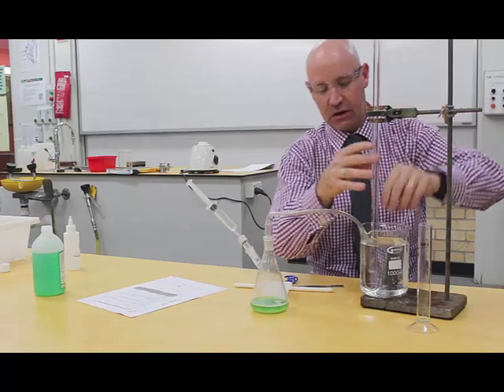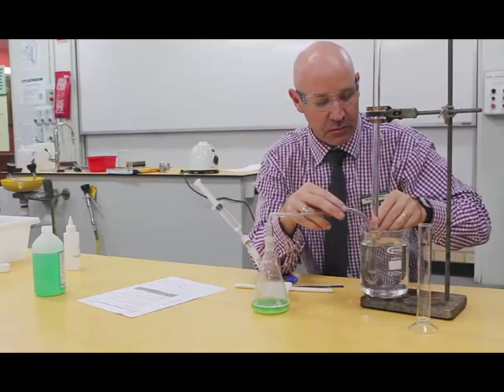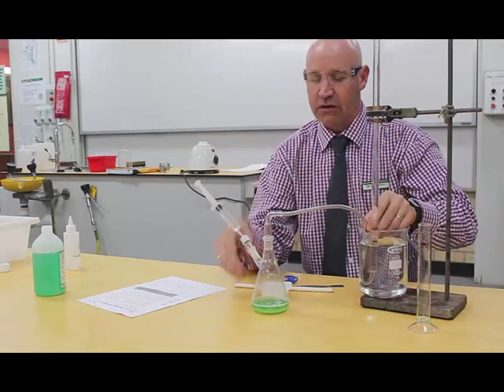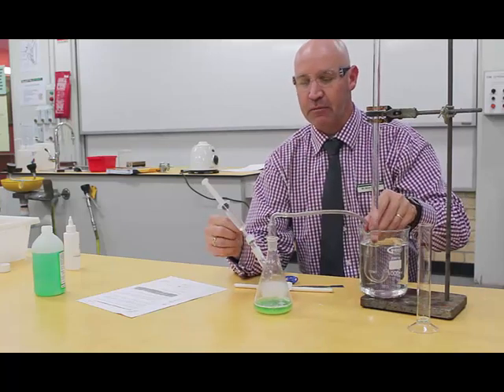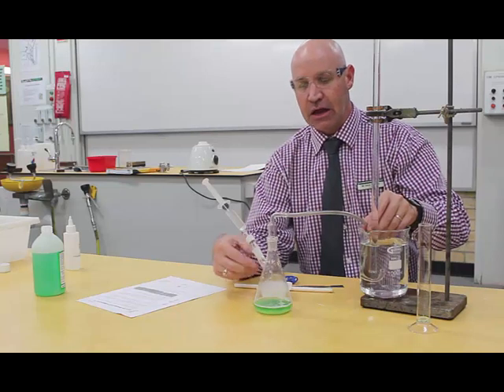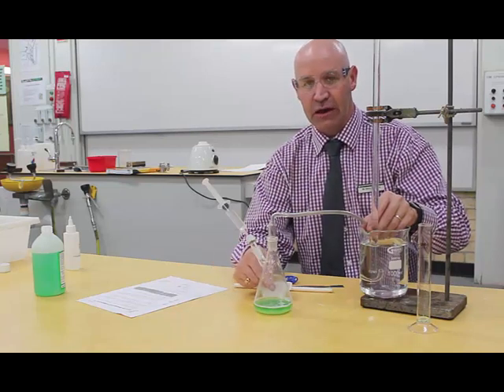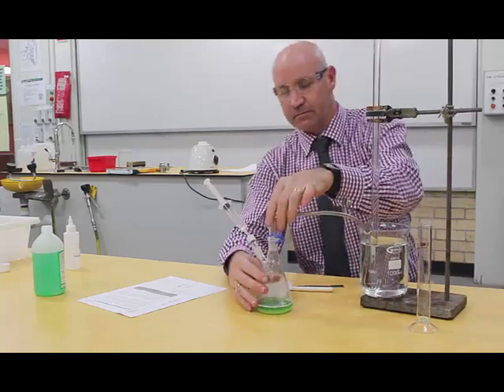So this tube is going to go into the neck of our measuring cylinder, but I'm actually going to wait until I push the hydrogen peroxide in. Because of course, when you think about it, if I'm pushing 10 mils of hydrogen peroxide in, then it's actually going to push out 10 mils of air, which are going to go up into here.